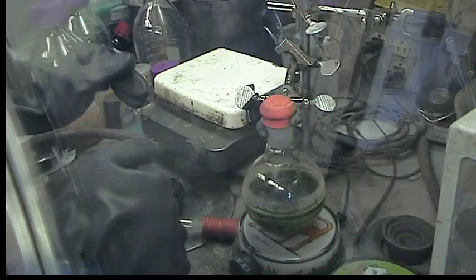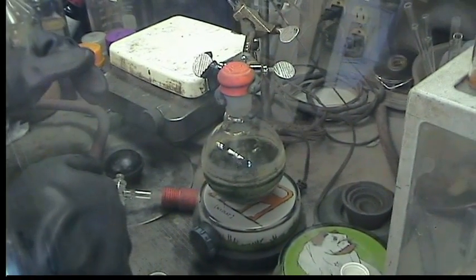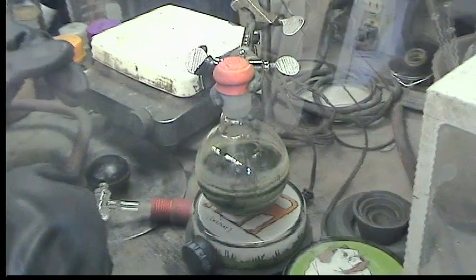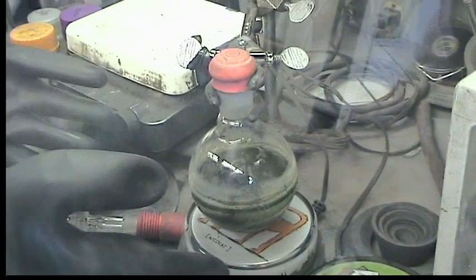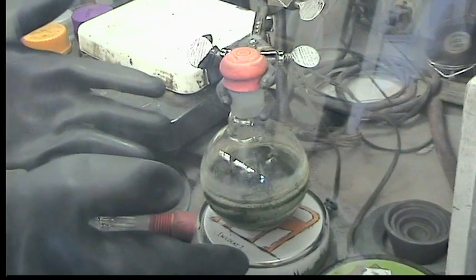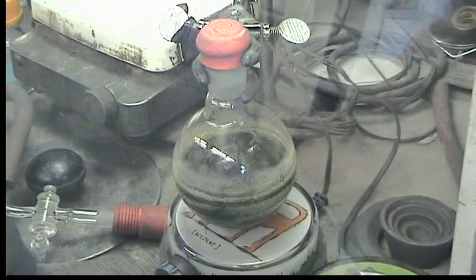The reaction has been stirring for just over three hours now. It's this dark green color and there's a noticeable white precipitate — that's the lithium chloride byproduct.